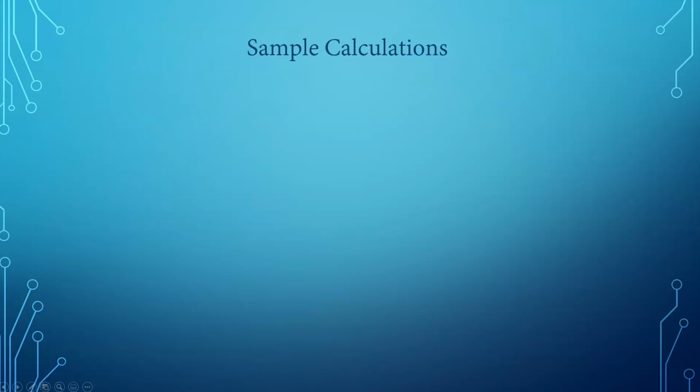Let's wrap up today's lab by running through a sample calculation for one of the 16 solutions that we tested, and then you can go ahead and do the other 15. So let's take a look at the 15% sodium chloride solution just as an example.